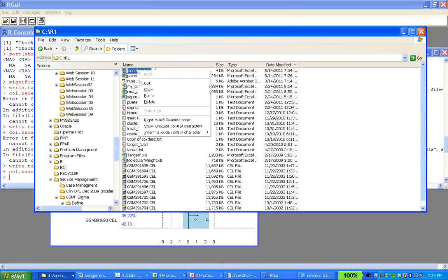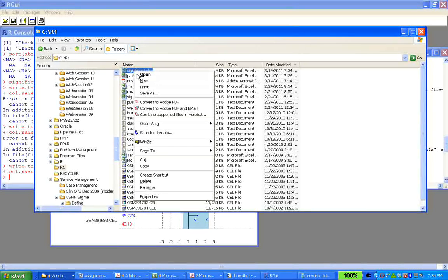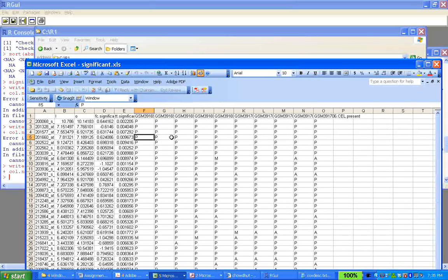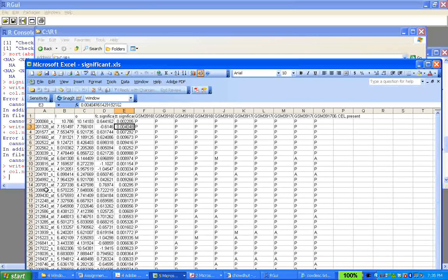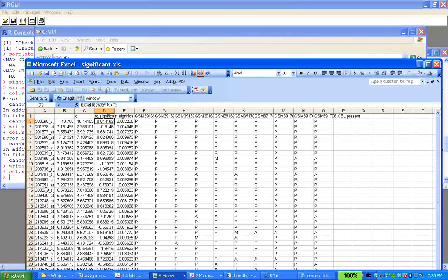So in this scenario, okay, if I don't do the condition that the present has to be in all 10 arrays, I get about 29 of them that meet my criteria, where the test statistics is less than 0.01, so these are very, very low test statistics, and the fold change here is minimum about 1.5.